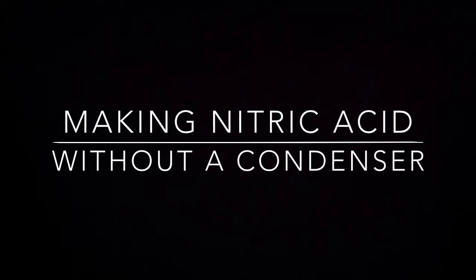MacMacSci presents Making Nitric Acid Without a Condenser.